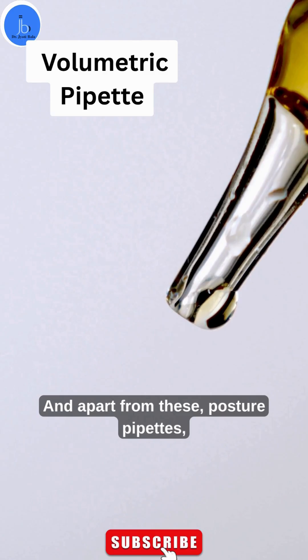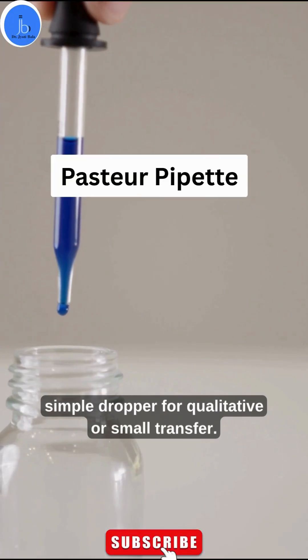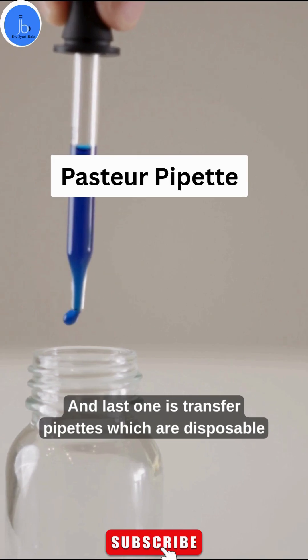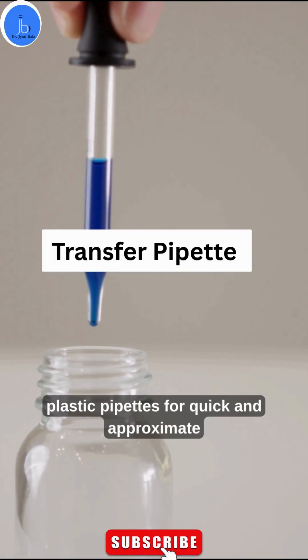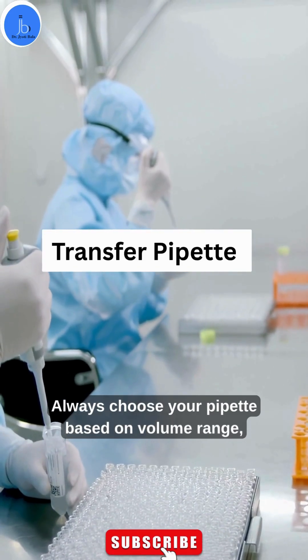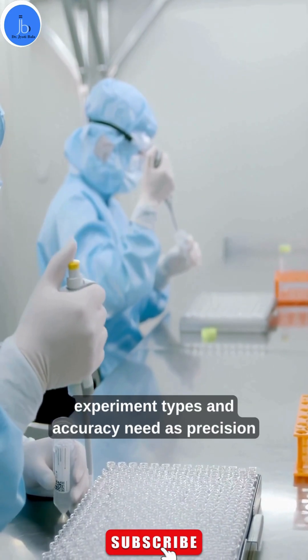Apart from these, Pasteur pipettes are simple droppers for qualitative or small transfers. Transfer pipettes are disposable plastic pipettes for quick and approximate transfer. Always choose your pipette based on volume range, experiment type, and accuracy needs.